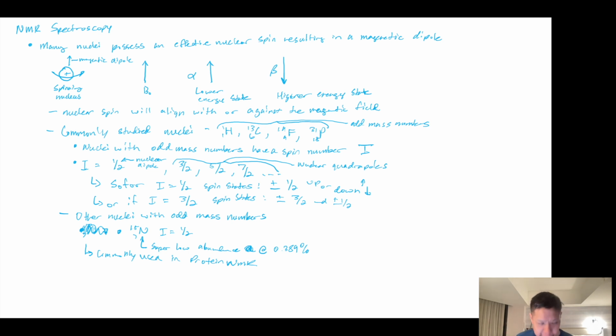And so we can do very fun, very interesting experiments where we use solution NMR to watch a protein change its conformation due to conditions like interacting with its environment or interacting with its substrate. And the peaks will change, right? Because we are studying the movement of the nitrogen 15s in the backbone. But again, it's very, very low abundance. So how are we able to study protein conformations with it on NMR?